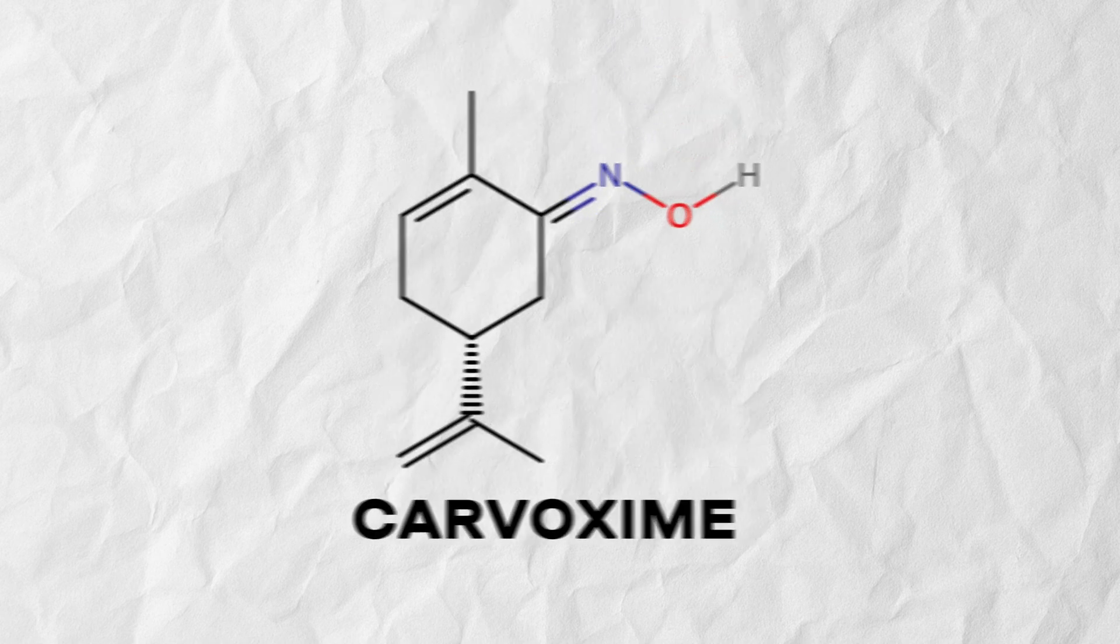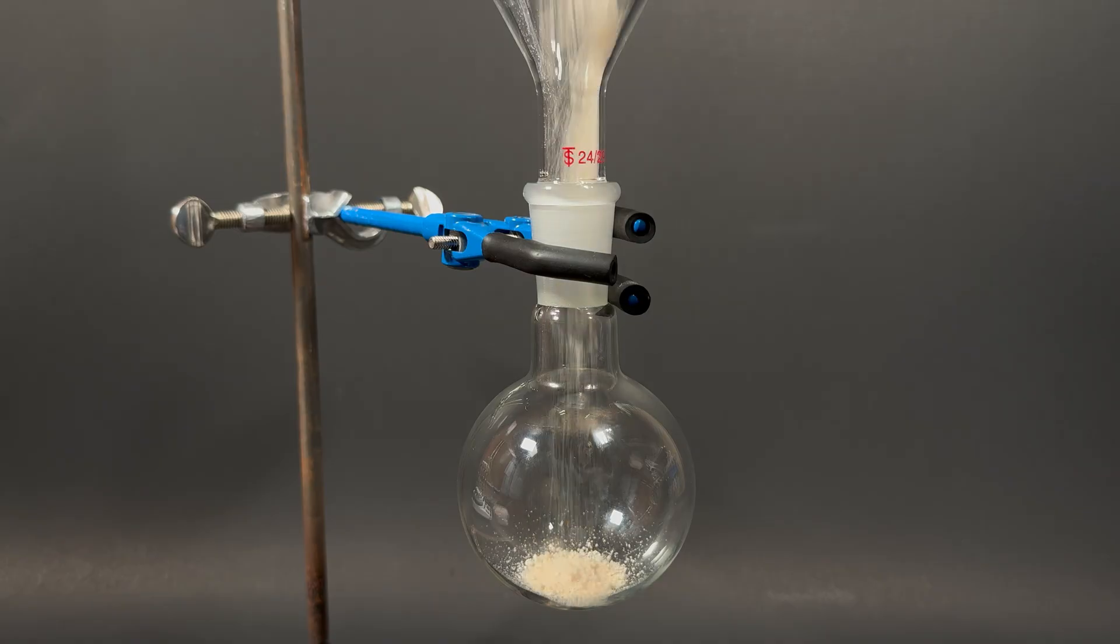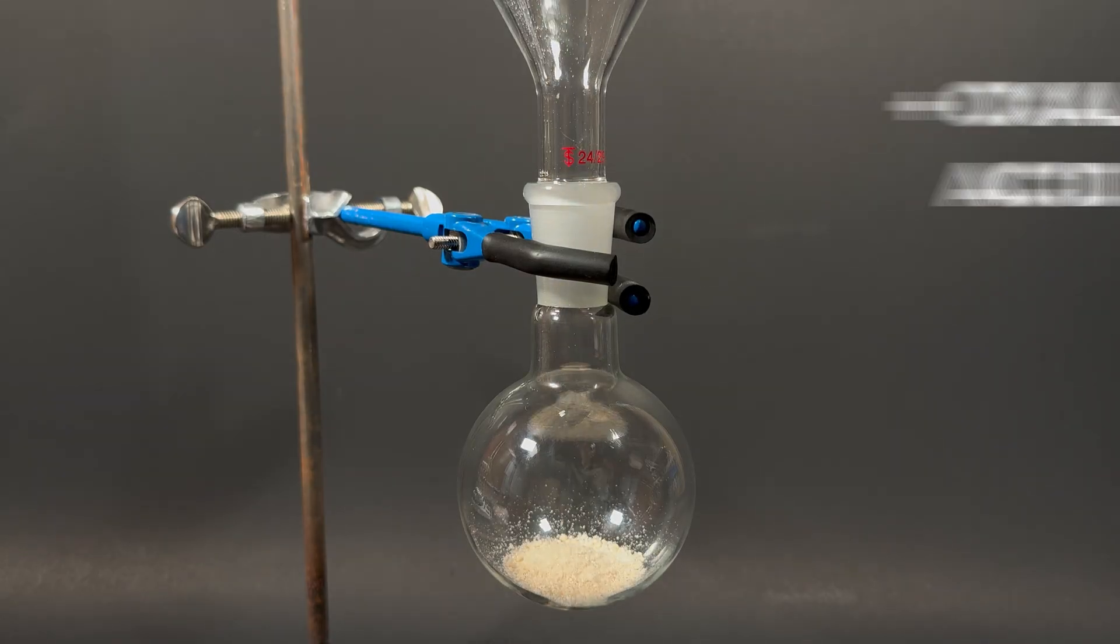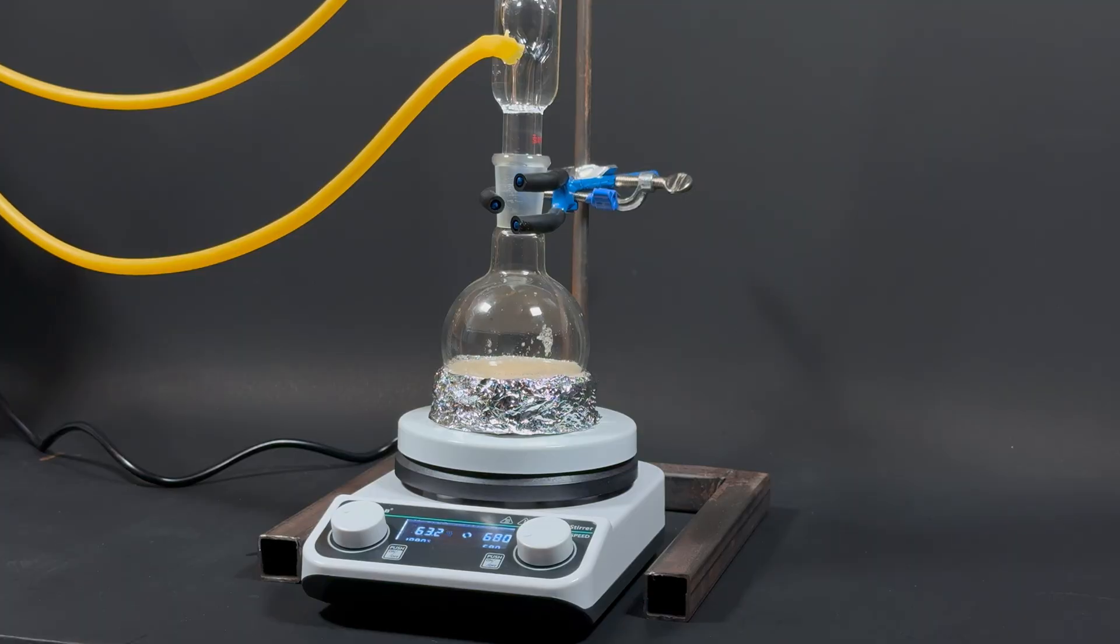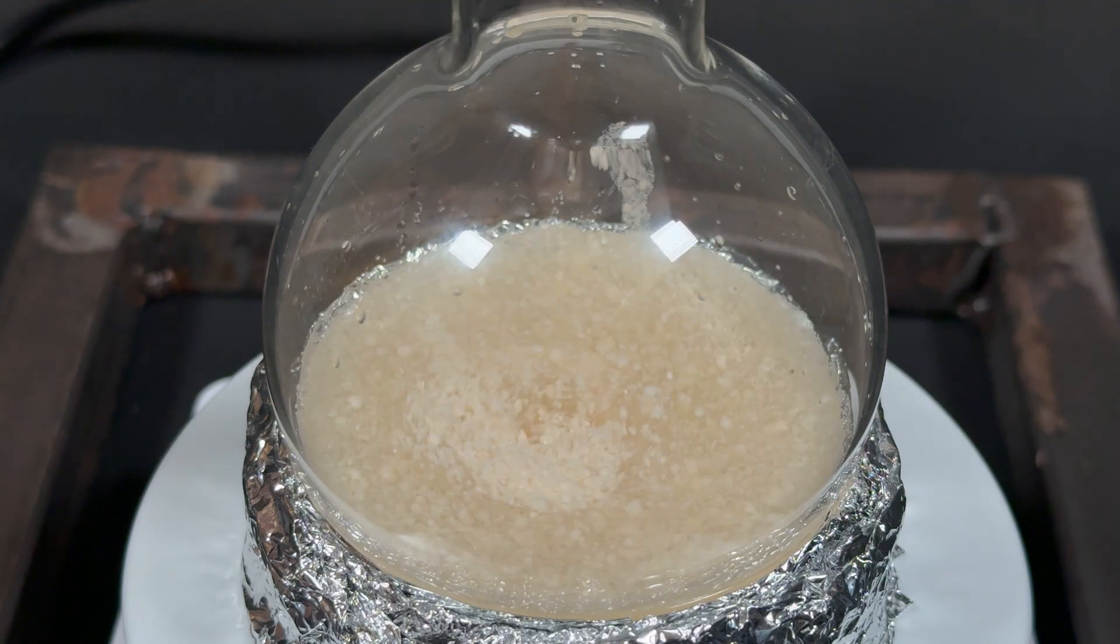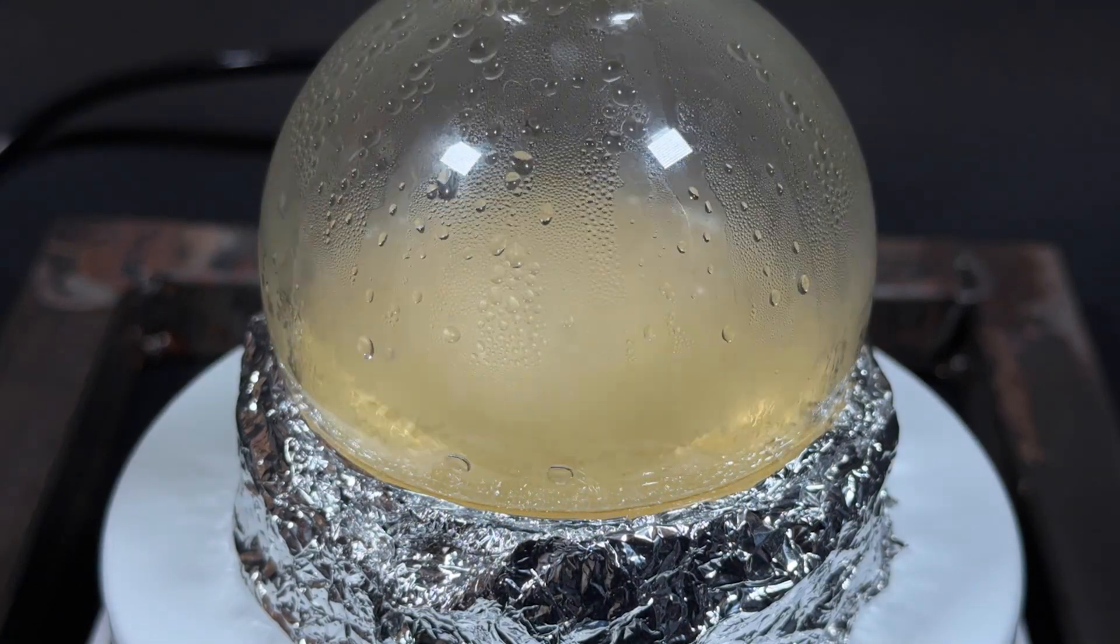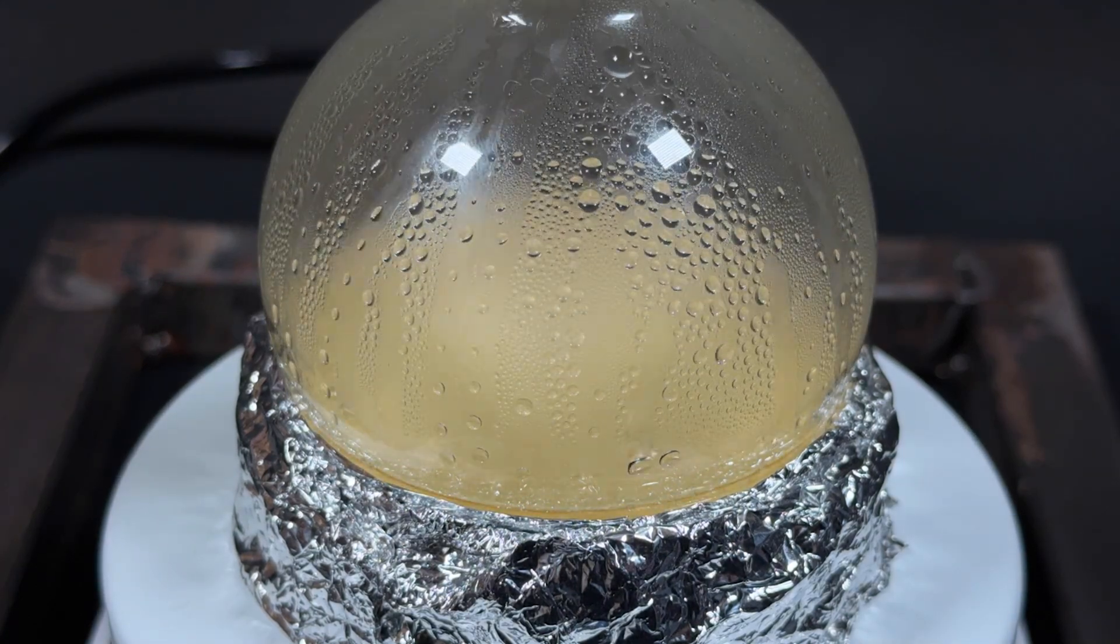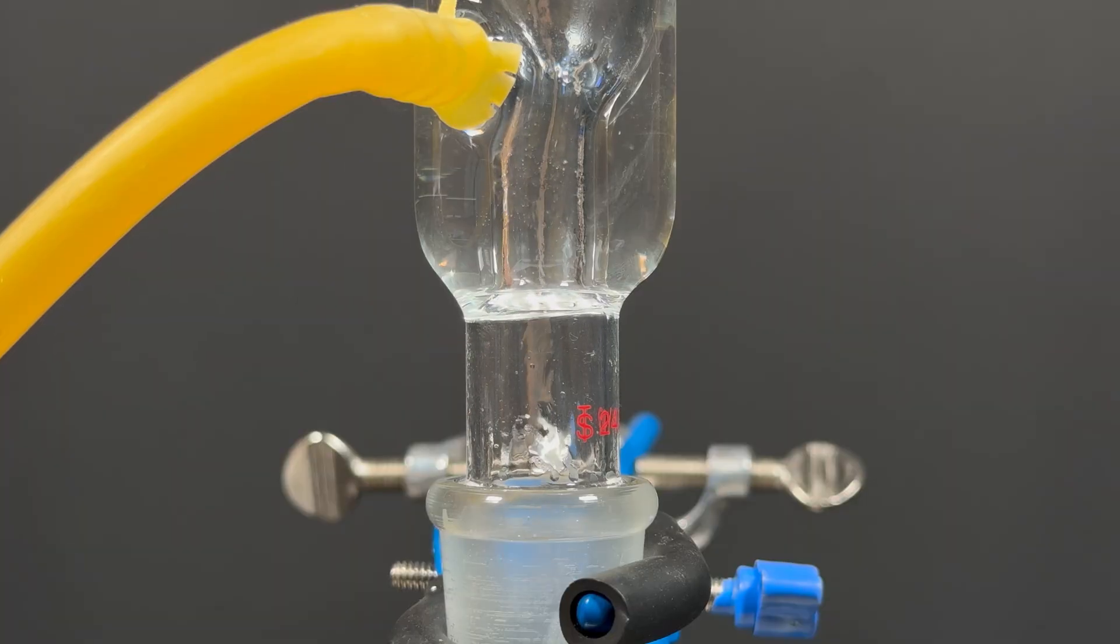And now, the final stage. It's simple. We need to turn carvoxime into the final minty aroma, L-carvone. I pour the powder into a flask and add oxalic acid and water. Put a condenser on the top and start heating. It needs to boil for an hour. After 10 minutes, everything dissolved. And something oily started floating. I was so happy to see those droplets and smell mint in the lab.